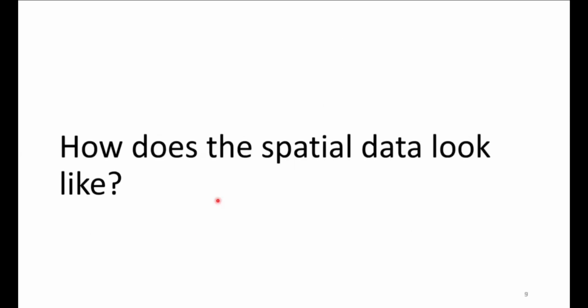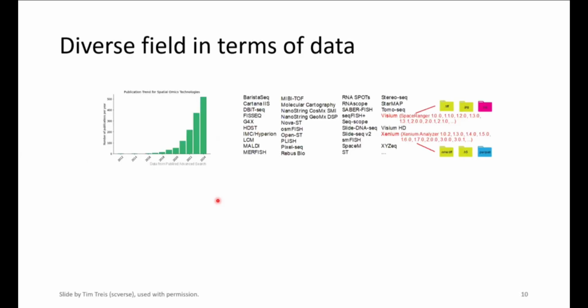And now if we go into spatial data, what additional layers of information do we have other than tables? And I think obviously, right, we have images, and we somehow have to store that spatial information. And this spatial information is quite diverse in terms of technologies.